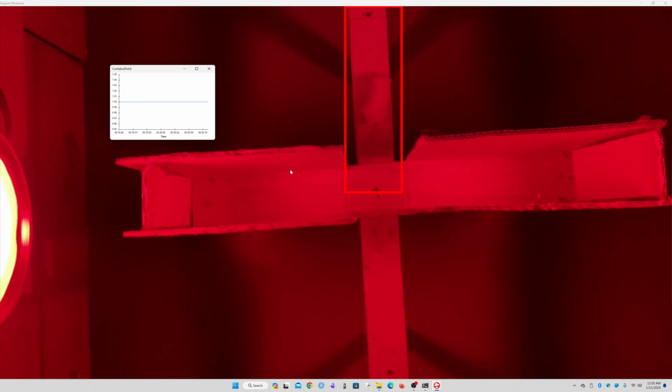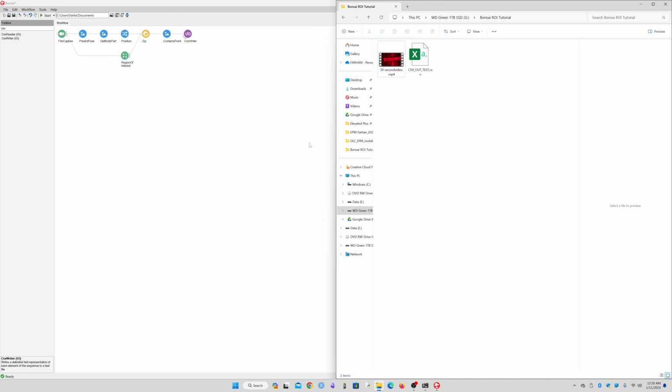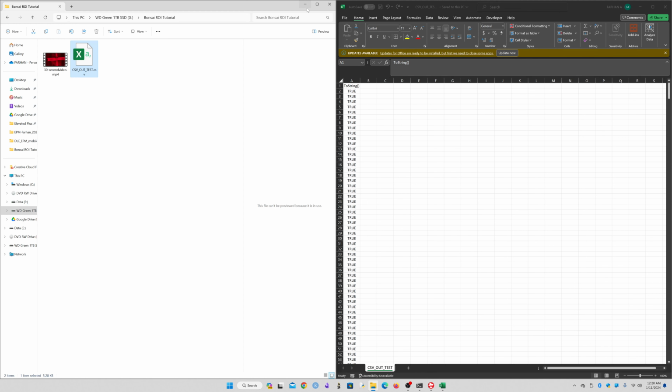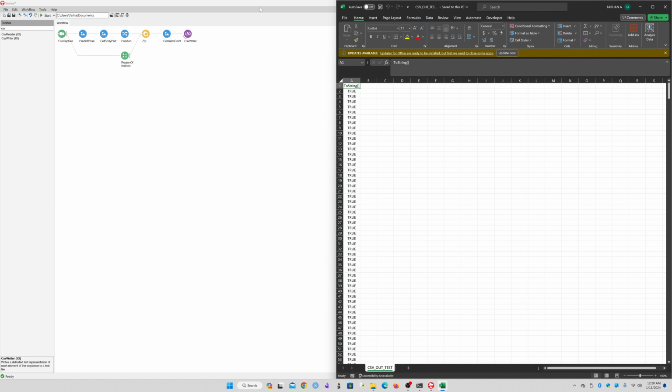All right, there we go. The analysis of the 30-second clip is done. This is my CSV out test, and as you can see, this is all going to be true because the mouse is always inside of my region of interest. There are a couple of formulas we can use. For example, COUNTIF, and I can select the range here like this.